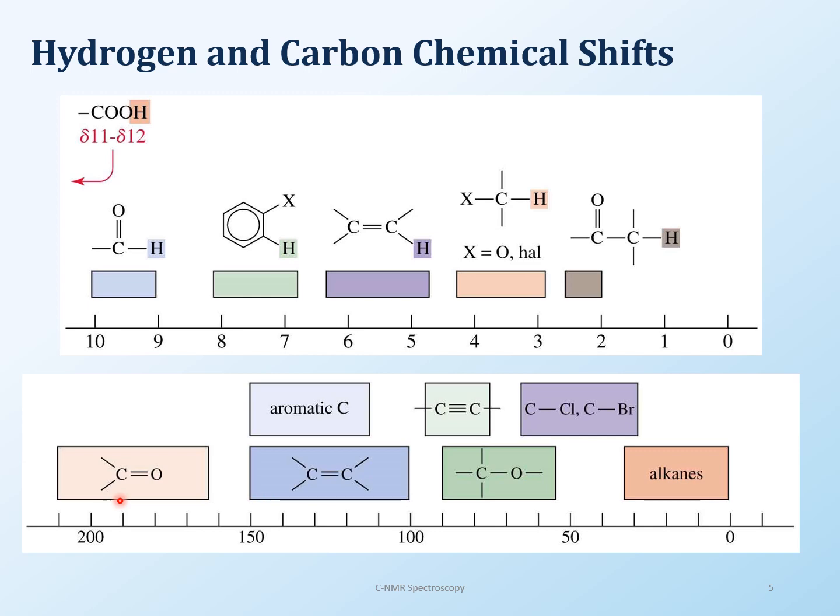Now the thing that you need to remember for chemical shifts here is the downfield and the upfield. Just like for protons you have the upfield and downfield, it's the same thing here.